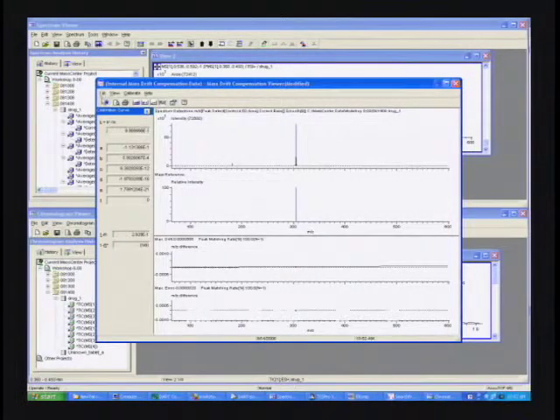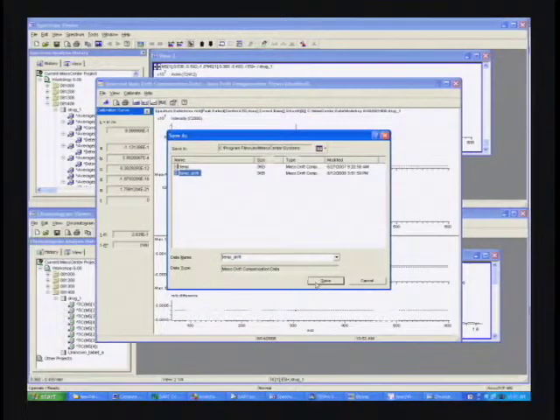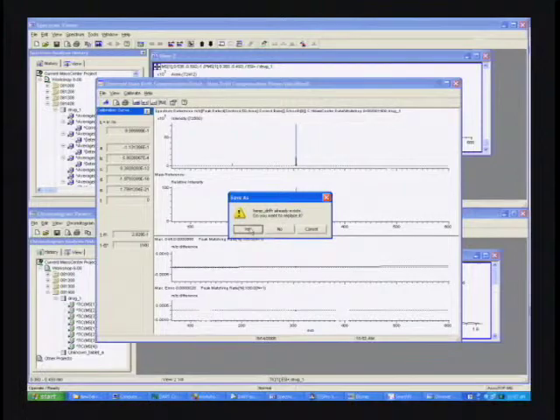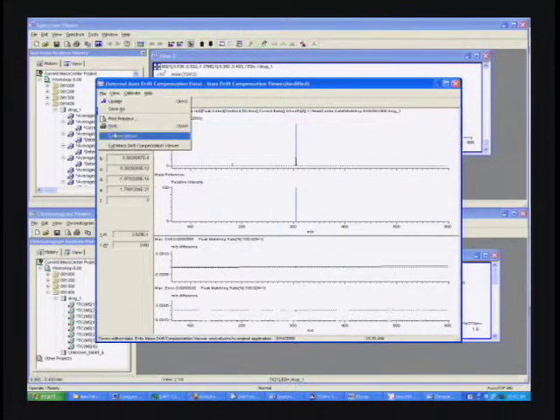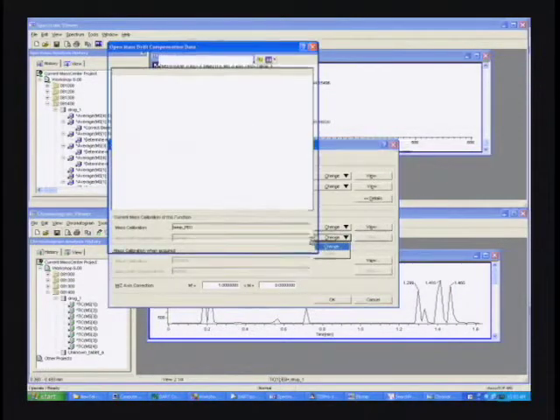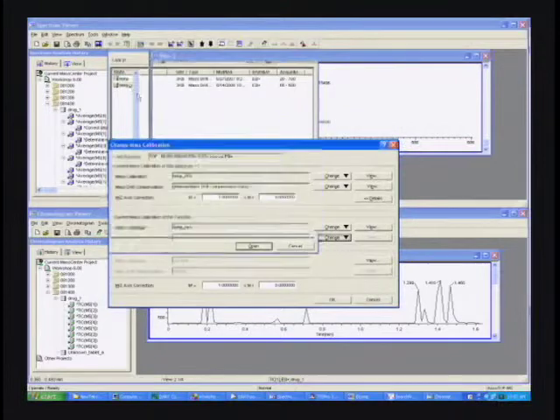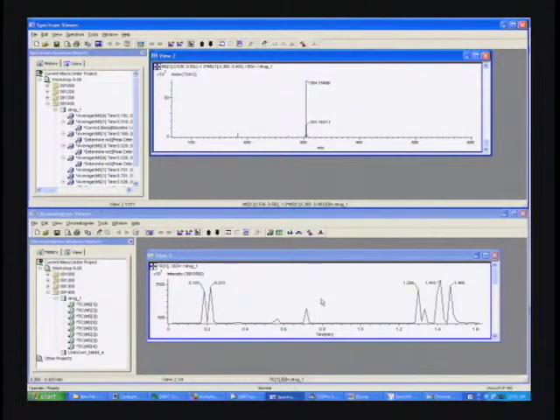This obviously was pretty close to start with, but we'll save that as our temp drift file. And we'll replace that because it's just a temporary file. We'll exit, then return. And then this would also be applied to each of the functions as we would collect the data, or as we would reduce the data.